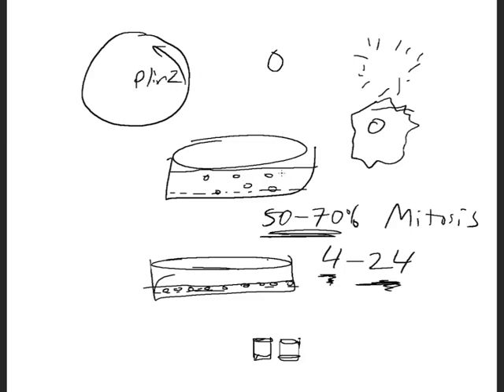For our transfection protocol, we would use a 96 well plate and we would cause some of them to be transfected with this plasmid with PLIN2. And then, of course, we'd have a couple of controls. Some would just have the GFP control and others would have the PLIN2 vector. And we would split it up that way and you'd be able to compare the two.